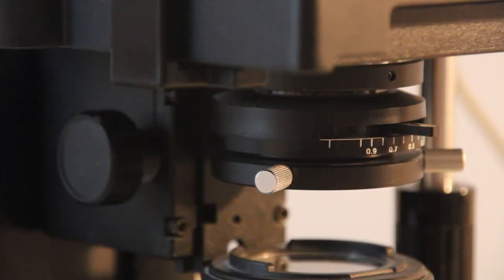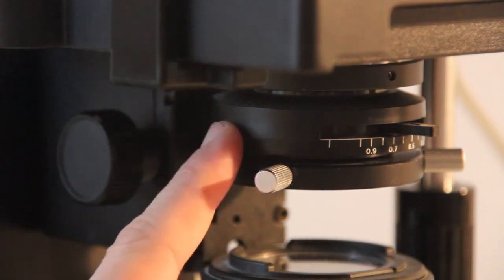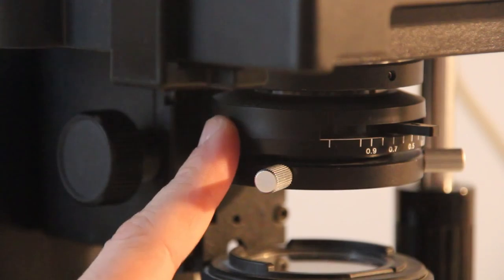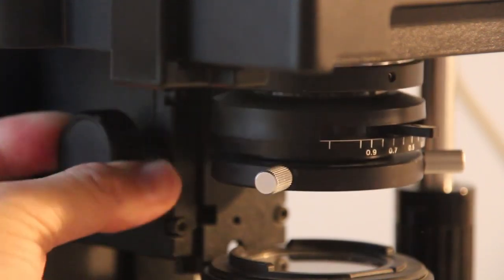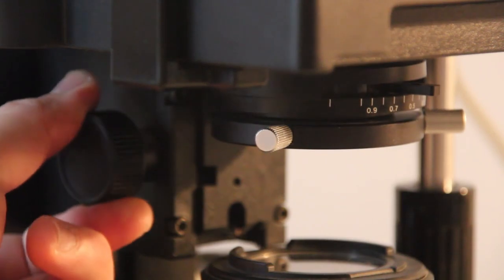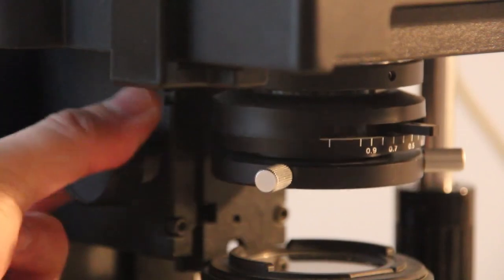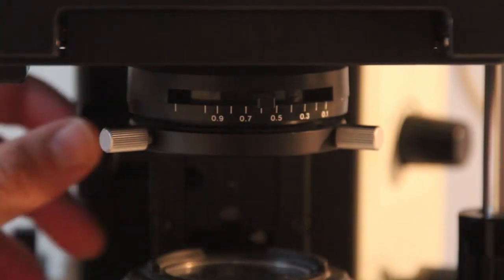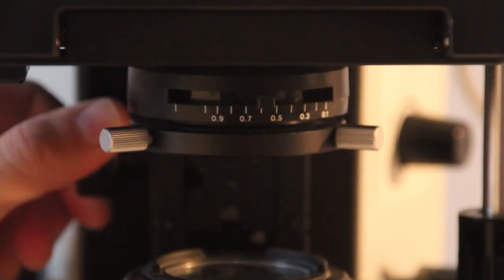Next, have a look beneath the stage — you can see the condenser. The condenser can be raised and lowered by turning a knob. Make sure that the condenser is raised all the way towards the top. We have now raised the condenser to the topmost position.